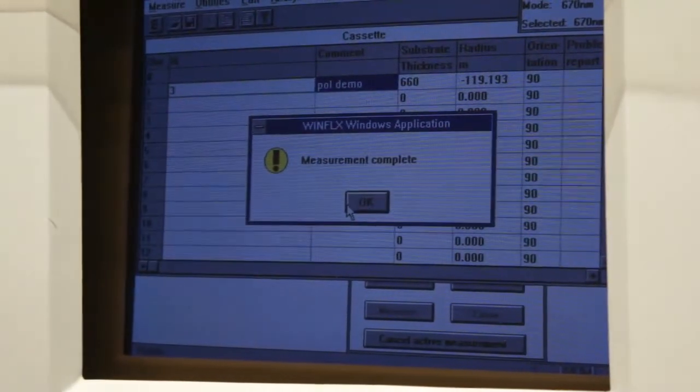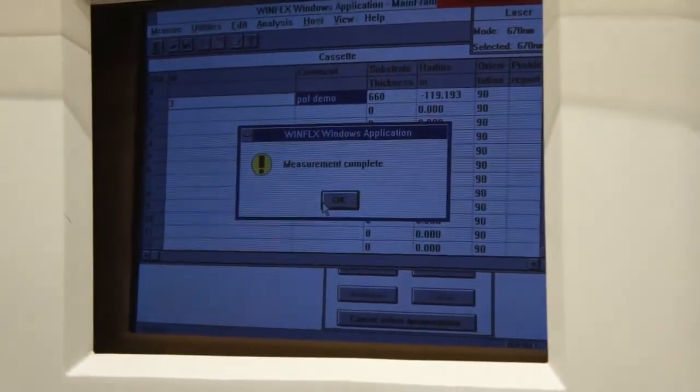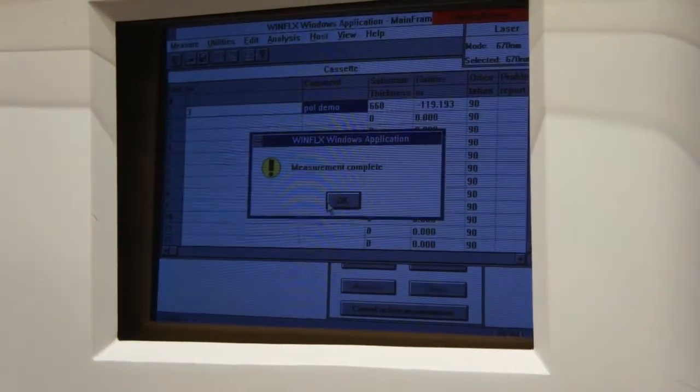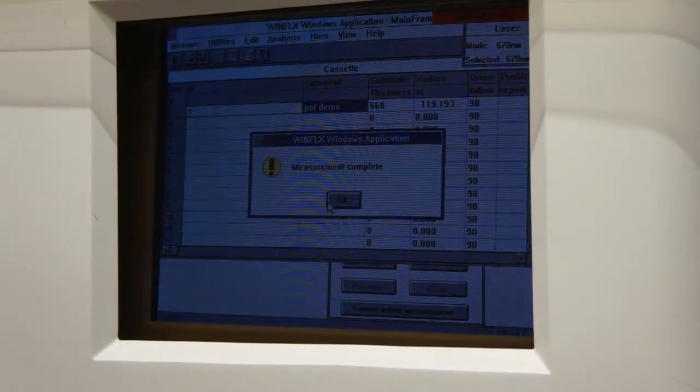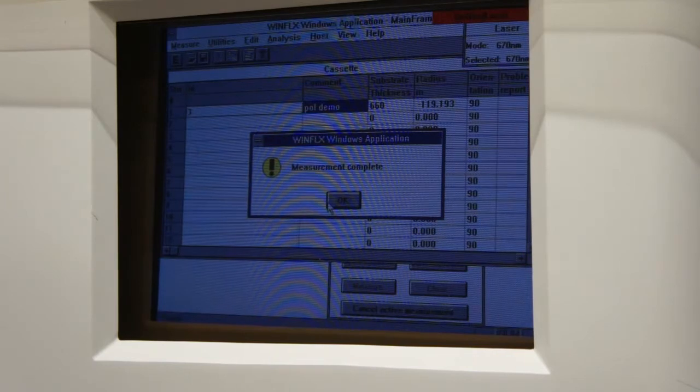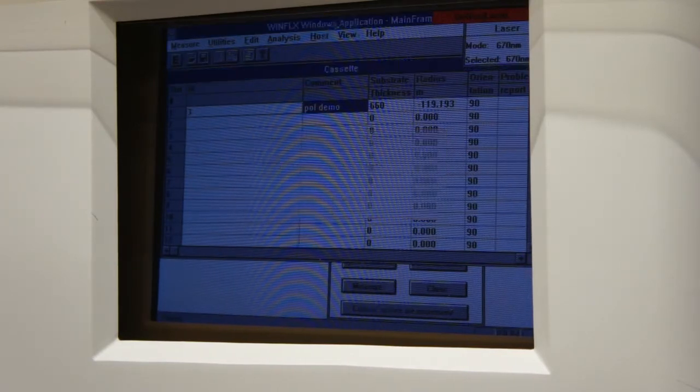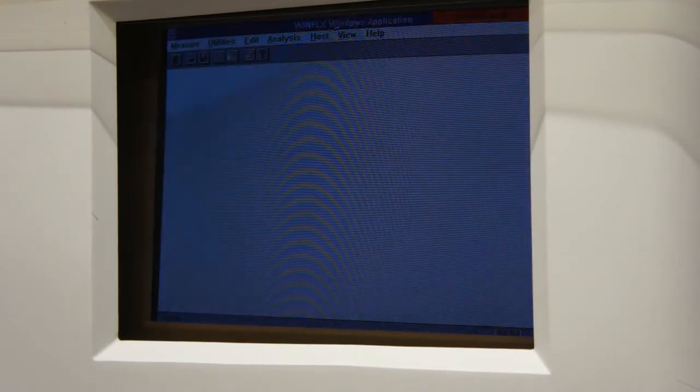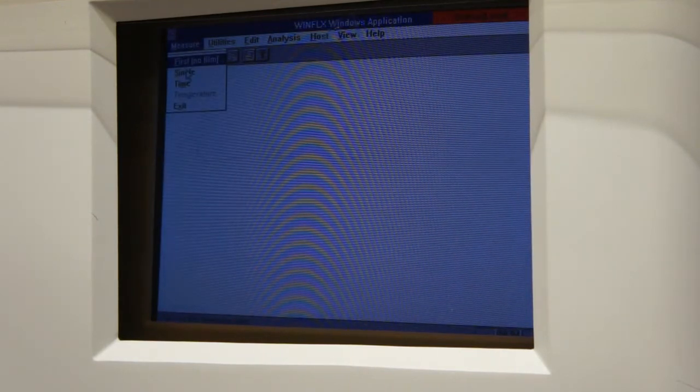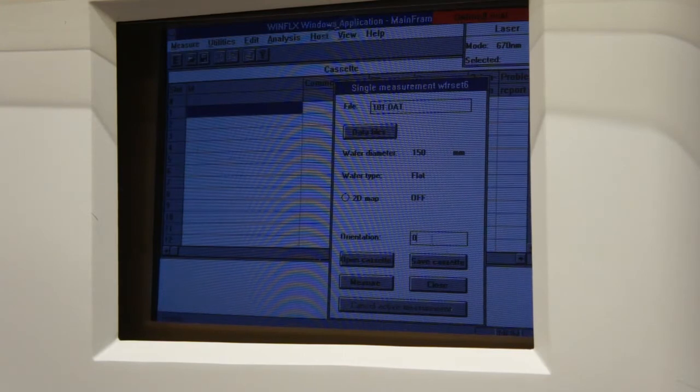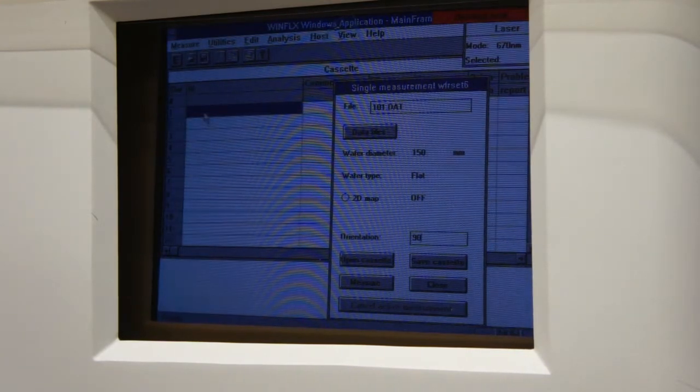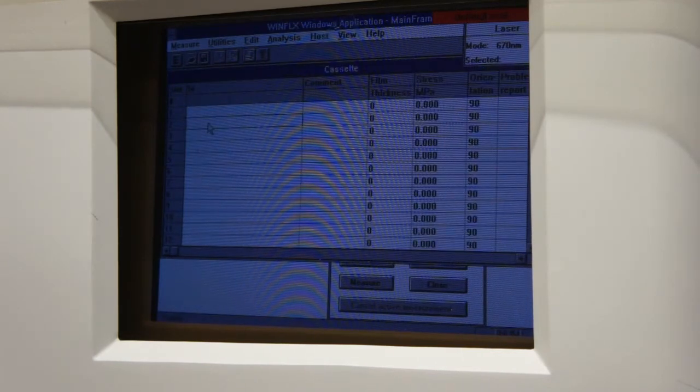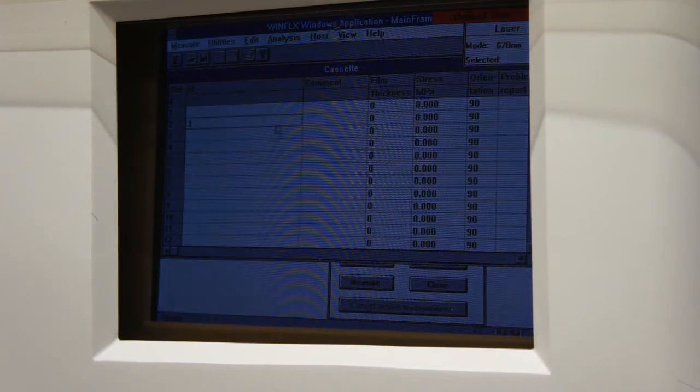Okay, so the second part of the wafer A and B measurements is to measure B for our megapascal stress measurement. So, I'll go ahead and click on this. We're going to do a single stress measurement. And then we're at 90 degrees. And then we're going to go ahead for 2, which is wafer B.